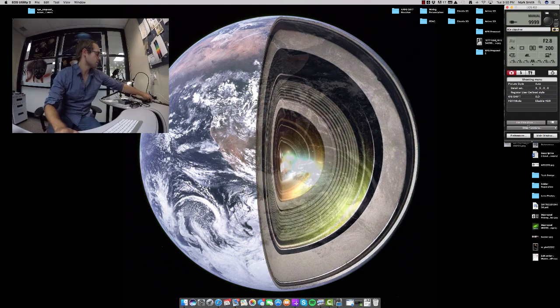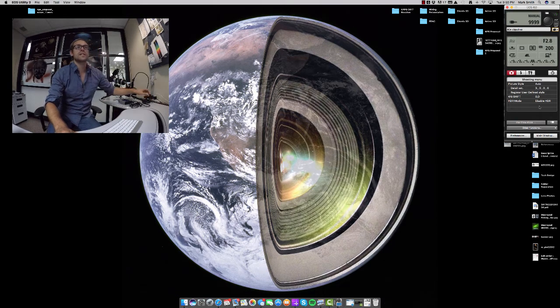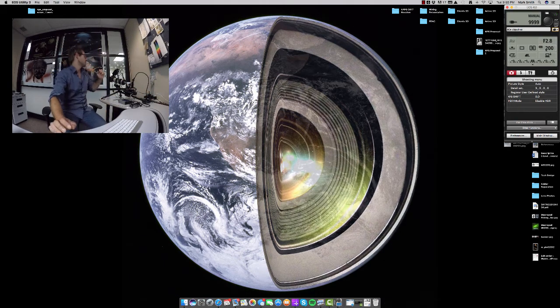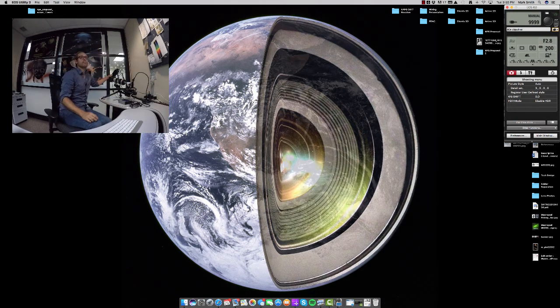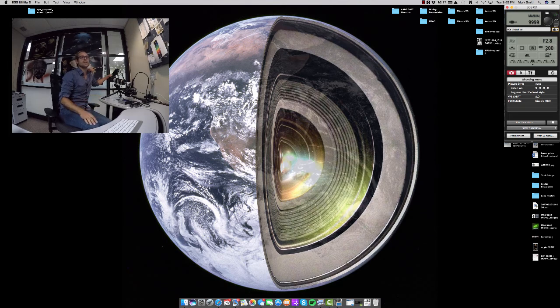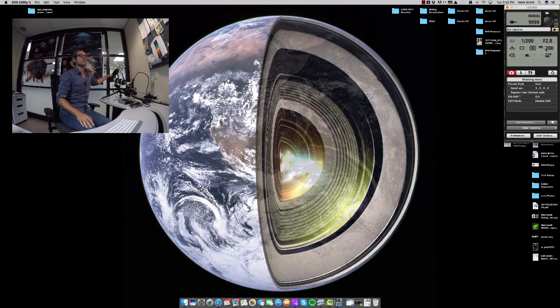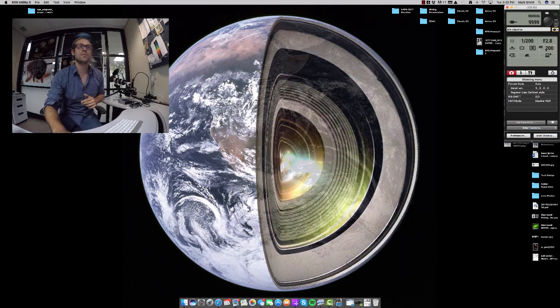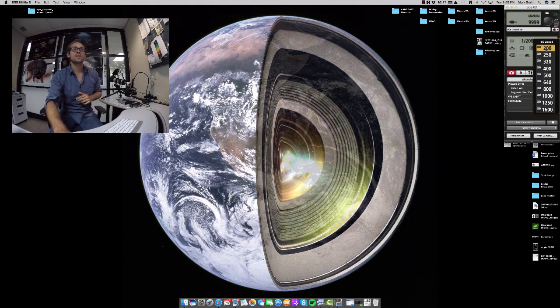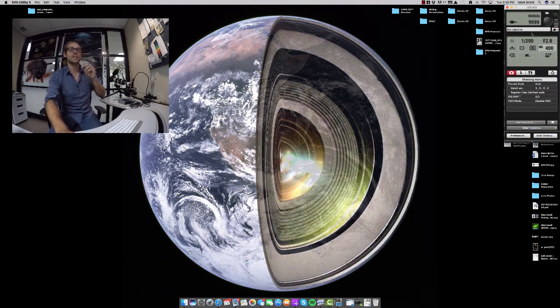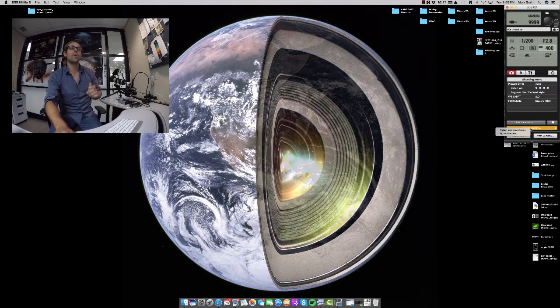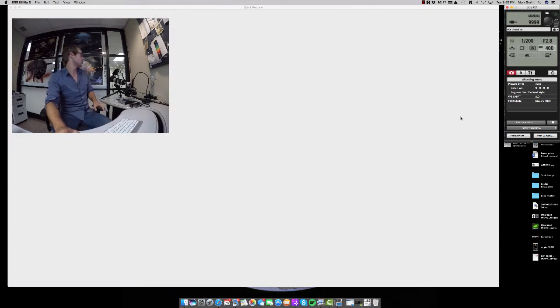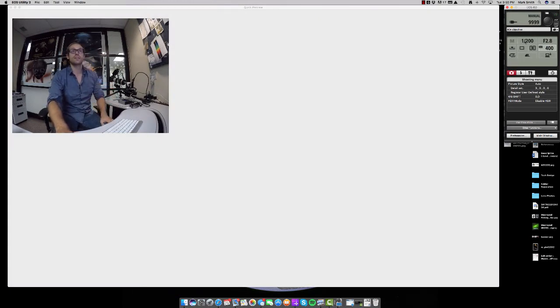We're going to turn off the direct light source. And I think also for this shot, we're going to bump up the ISO, probably to 400, but we'll just test that real fast. So first we'll just go here, change the ISO. We'll open up a quick preview window. Remember the lens settings don't change.